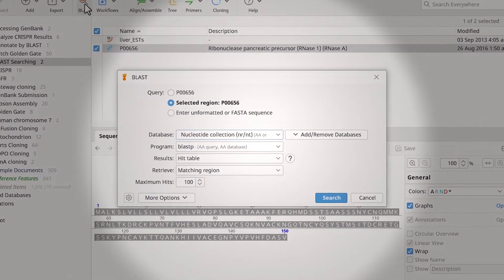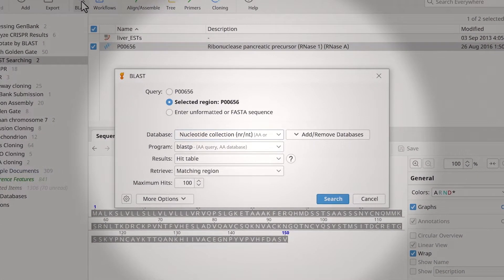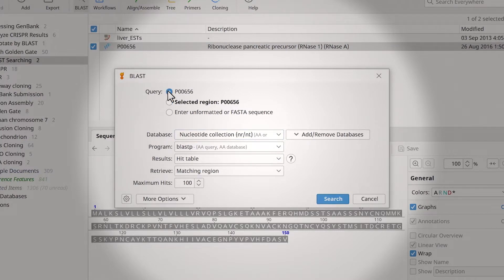In the new window, specify the sequence to be queried. You can choose between the whole sequence, a highlighted region, or enter a FASTA sequence.